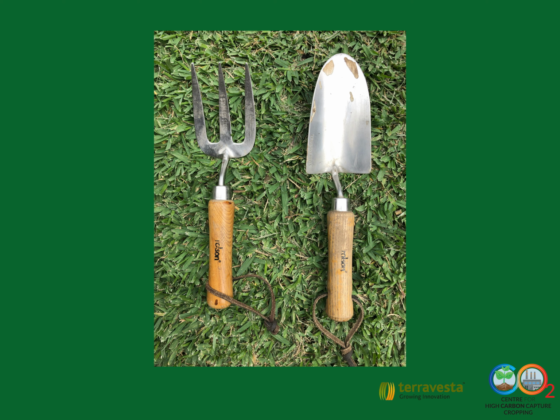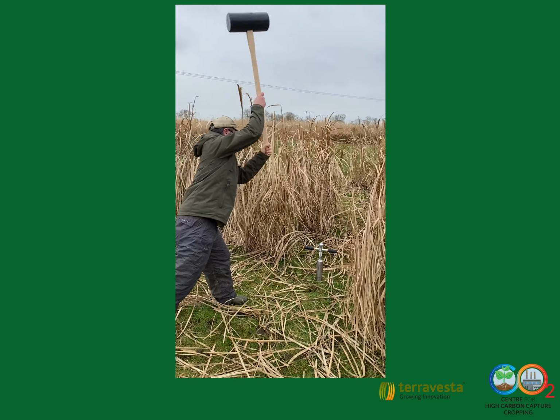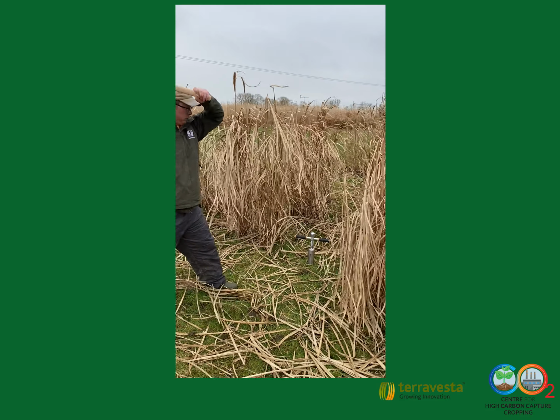Then prepare the soil by clearing the soil surface of any residues using a trowel, ensuring a level surface for accurate sampling. Then gently hammer the split tube core into the ground until it reaches the desired depth of 40 cm, ensuring it is level with the soil surface.